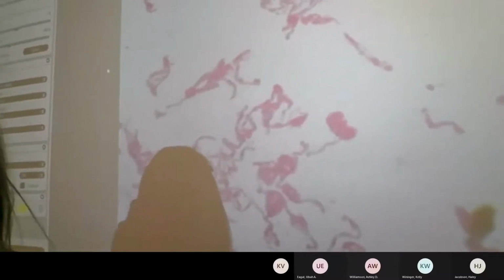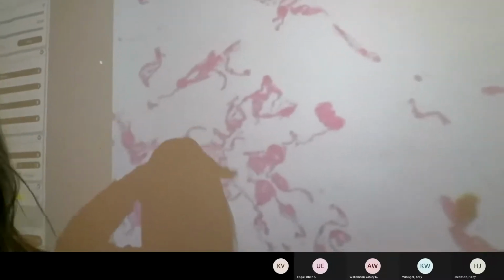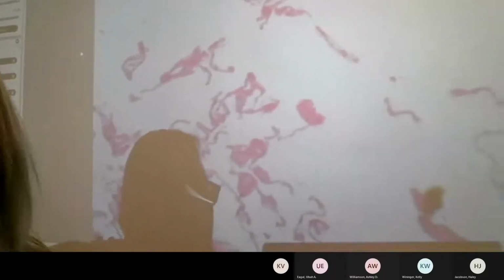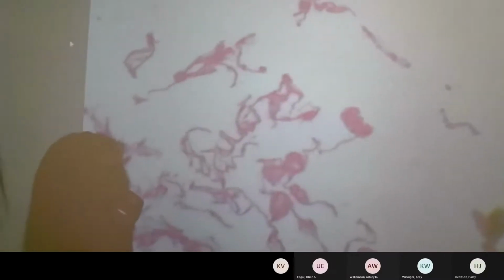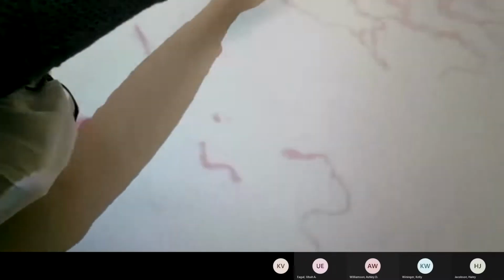After we establish that the cells are multi or single layered, then we want to start looking at the cells themselves. You're trying to look for tubes, air holes, or places where something would end and airspace, or water or blood or something would flow. The first slide is supposed to be lung tissue, so you're trying to see air sacs, alveoli, and cells that would line these air sacs.